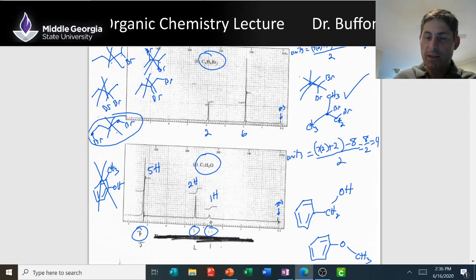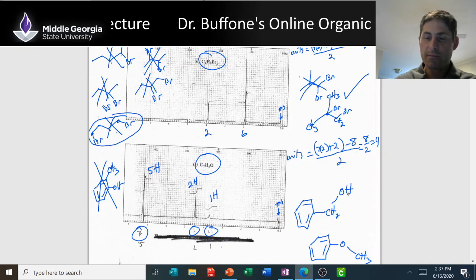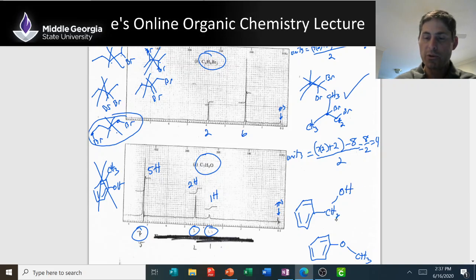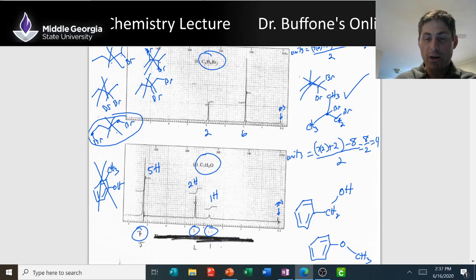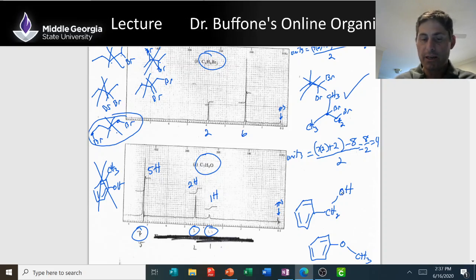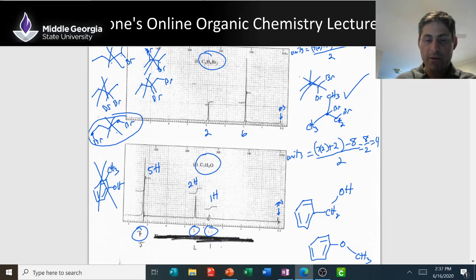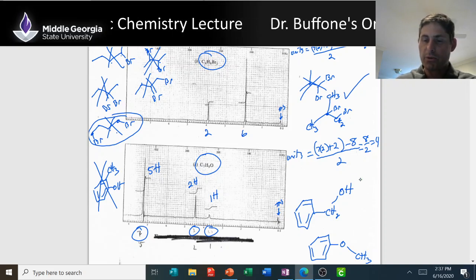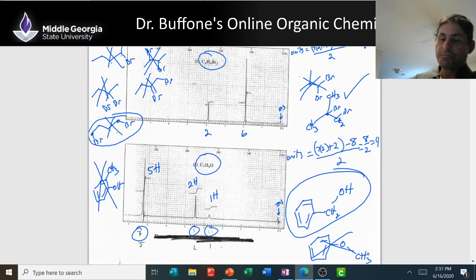Look how rounded this is. Alcohol, right? Singlet that is rounded, no splitting, OH group, 1 proton. This one would have 2 protons. It's on an aromatic ring and it's on an OH, so everything's way de-shielded, right? 4.5, this varied, went to 3.8 or something, and this at 7.2. That's what I'm guessing right there.